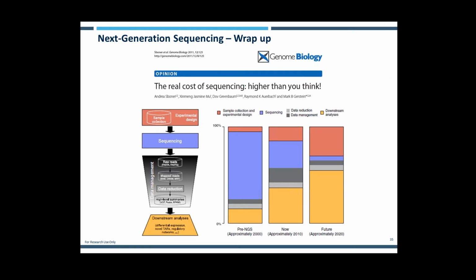What you need there is an interdisciplinary team of bioinformaticians, statisticians, geneticists, biologists, and physicians, all required to be on hand to translate the information and the primary data to useful knowledge and to understand the impact of the genomic variants in the biological system. And this can take weeks and months of extensive experimental validation using things like downstream animal models or cell lines.